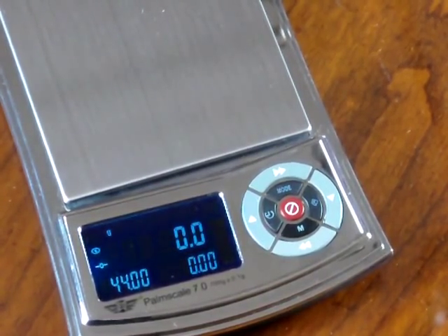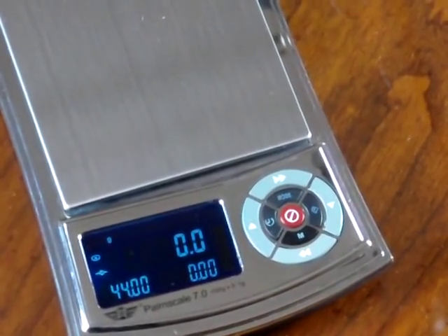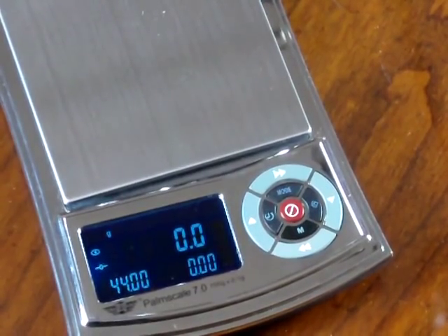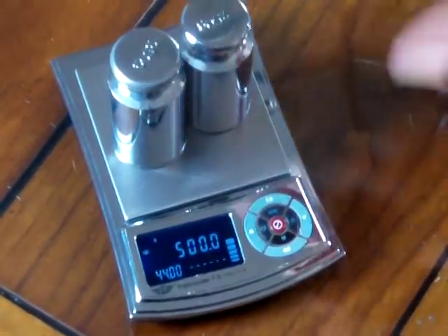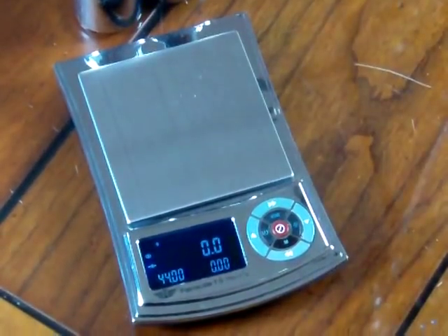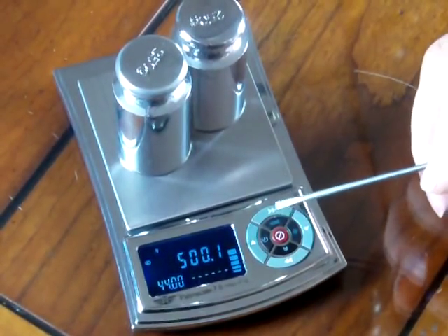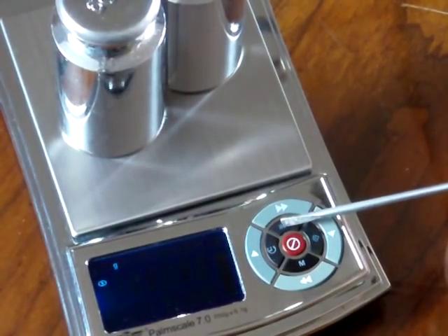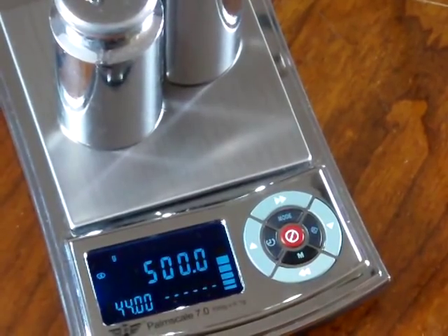Now let's go over the calibration. Calibration on this scale is really easy. To calibrate the scale, all one needs to do is have the calibration weights — the scale comes with two 250 gram weights, so that comes out to 500 grams. To do the calibration, you put the two weights on the scale and press and hold down the mode button — that's the top button on the inner circle. You'll see it flashes the required weight, which is 500, flashes it two times, and then it says 'Pass.' So the scale has now been calibrated.